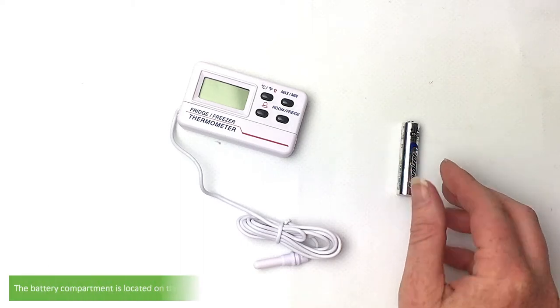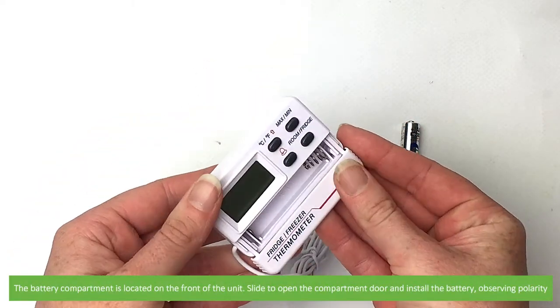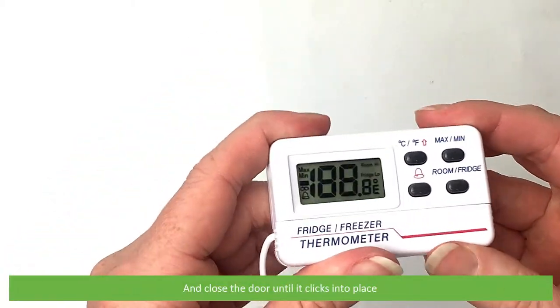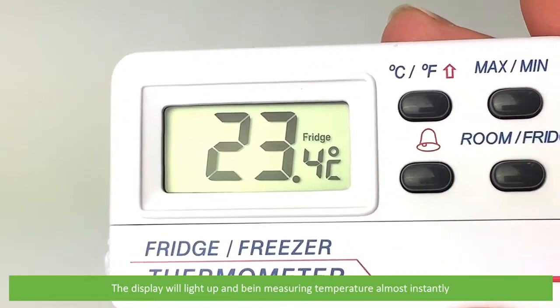First you'll need to install the included battery. The battery compartment is located on the front of the unit. Slide to open the compartment door and install the battery observing polarity. Then close the door until it clicks into place. The display will light up and begin measuring temperature almost instantly.